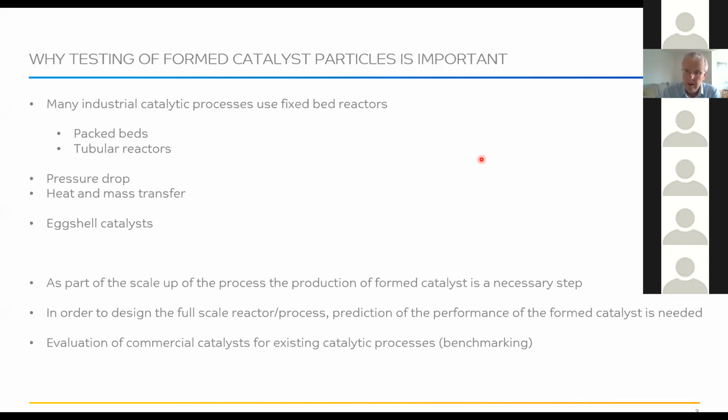Although there are models people use to extrapolate the performance of powder catalysts to full-size catalyst particles, in many cases you're probably better to look at the performance of the full-size particle rather than having to use the models. The other point is that, even for an existing catalyst process, you might want to compare the performance of commercially available catalysts, what we call a benchmarking exercise. Again, you need to be able to test the full-size catalyst particles, particularly if they're an eggshell material.